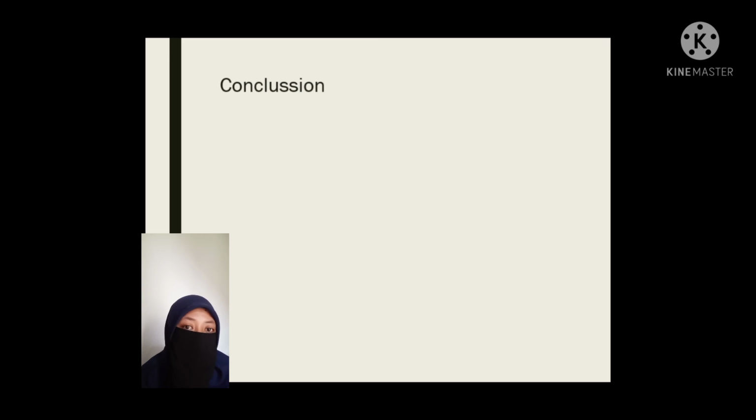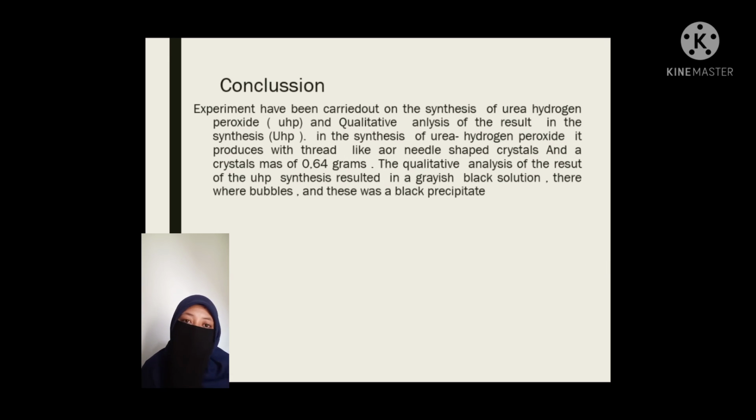Next, the conclusion. Experiments have been carried out on the synthesis of urea-hydrogen peroxide (UHP) and qualitative analysis of the result of the UHP synthesis.